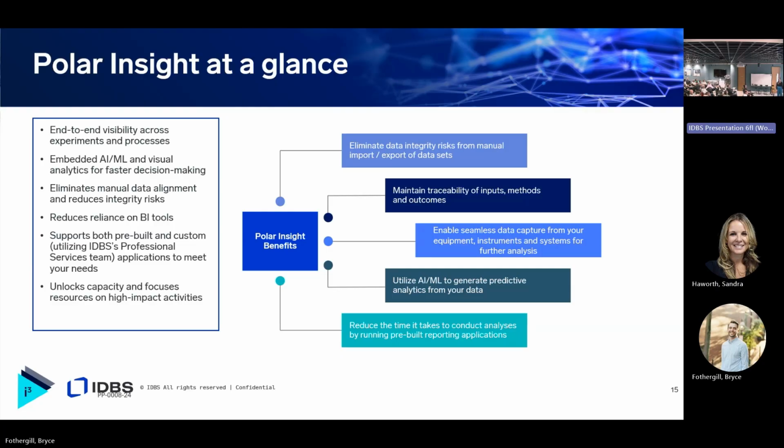But not only do we have pre-built applications, we also have a great professional services organization who are equipped to deliver custom Insight apps as well. So if our pre-built applications don't meet your needs, we can definitely create what you need out of Polar Insight. So that's a little bit of the basics on Polar Insight.